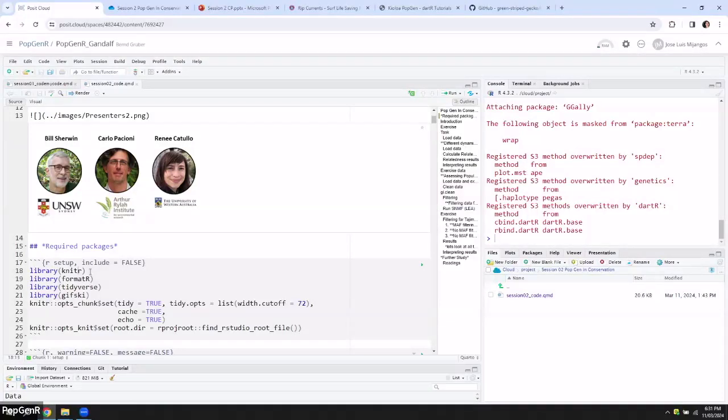No, that's a good point. So let's say you've gone through this process and you think you know what filters you want to do on your data set. Then yes, ideally you would import a data set that's SNP called on just those individuals. In some scenarios, it doesn't matter if you just import it, remove those individuals, and then run the rest of the pipeline. Those are both options you can do, yeah.